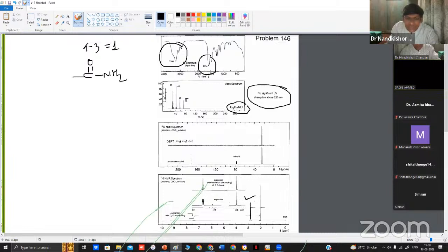So this expanded structure looks like a doublet, okay, and this is a singlet, okay. But this particular expansion is not just because of the coupling of the proton, but it may be the proton having a different environment in the stereochemical form that we will discuss later.